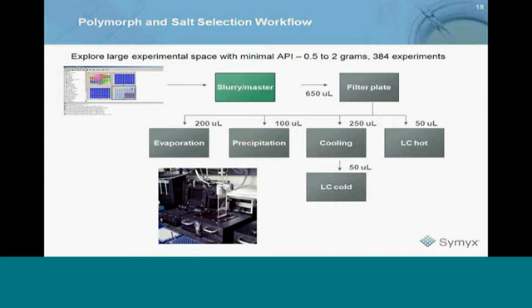The last thing is that it allows for a great deal of consistency in terms of being able to generate. If you're going to do 400 different crystallizations, you'd like a way to be able to compare these to each other. All these are done on the same days in the same stock solutions. They see the same thermal history. Makes it very consistent as a way of comparing different types of crystallization processes.